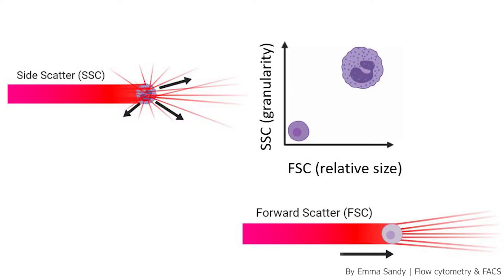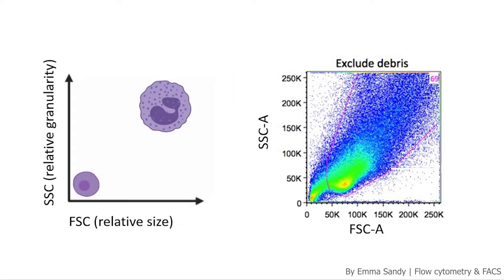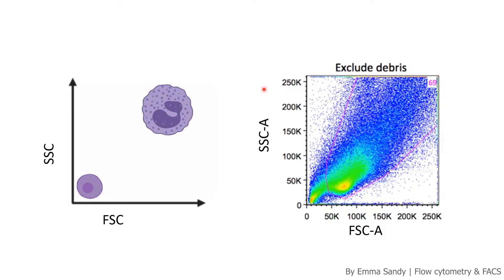The first bit of analysis we do is to just look at the cells. To get a profile of each particle, we look at forward scatter (FSC) and side scatter (SSC) to understand how the light is scattering past that particle. Here is some of my data — these are cells from a lung. FSC is proportional to cell size and SSC is proportional to granularity. This is what the data looks like: one dot per cell.